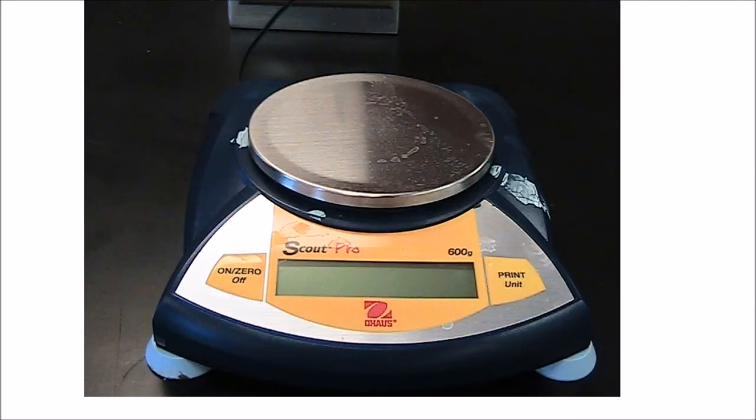Now, we're going to look at using the balance to start with, just to get an idea of how this will work, how we're going to gather the data. It will take very little time to gather these data. It may take a little bit longer to process them than to actually gather them. We use Scout Pro balances. These are the ones in the freshman lab, General Chemistry 1 laboratory. We also have some balances down the hallway, which we will use from time to time. I don't know if you'll use them this week or not. It just depends on how many you have in your lab and whether they're available.